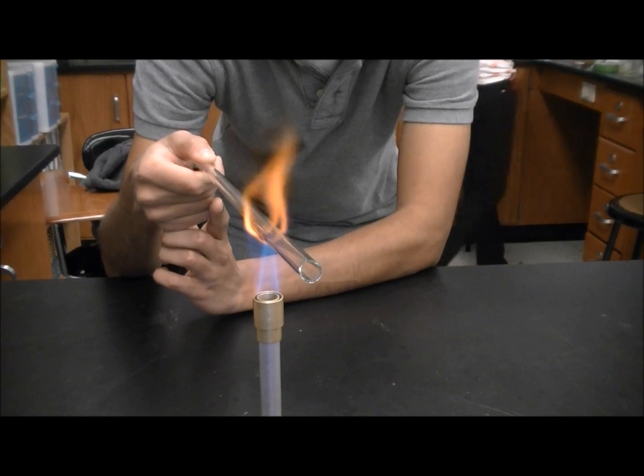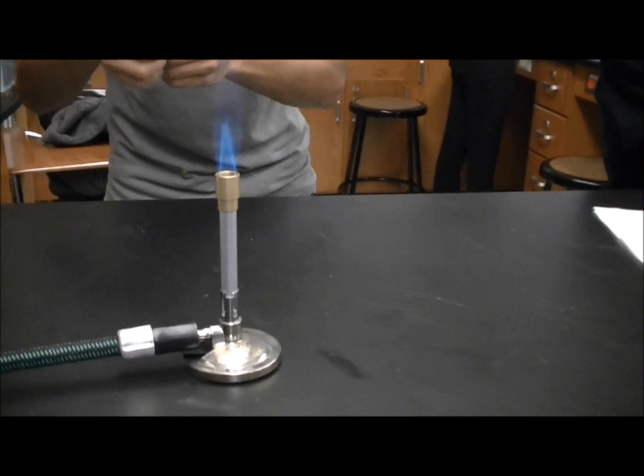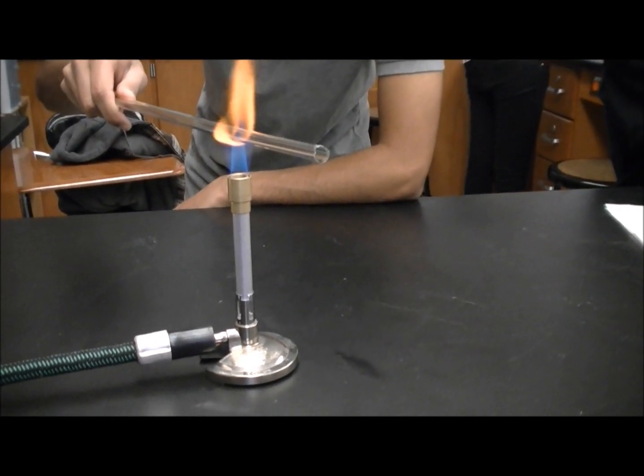Like right there. That's supposed to be like that? I think the flame is just like losing temperature — they're making a salt bridge.